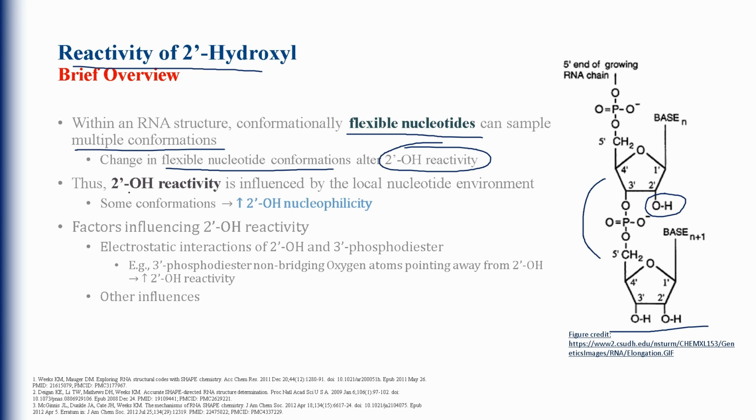But what you have to keep in mind is certain nucleotides are flexible and they can undergo certain conformations that make it so that that 2'-hydroxyl is more reactive, relatively speaking, to other RNA nucleotides within that same RNA molecule. So keep in mind that the 2'-hydroxyl's reactivity is influenced by the local nucleotide environment, and some conformations will result in an increase in the 2'-hydroxyl nucleophilicity.